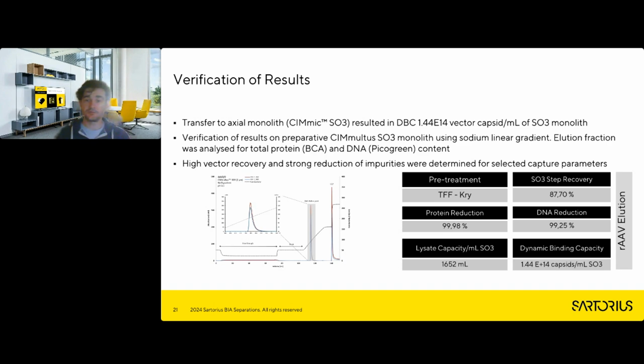We saw that with this we get high virus recovery. We recovered almost 90% of the virus. We removed almost 100% of proteins and more than 99% of DNA.